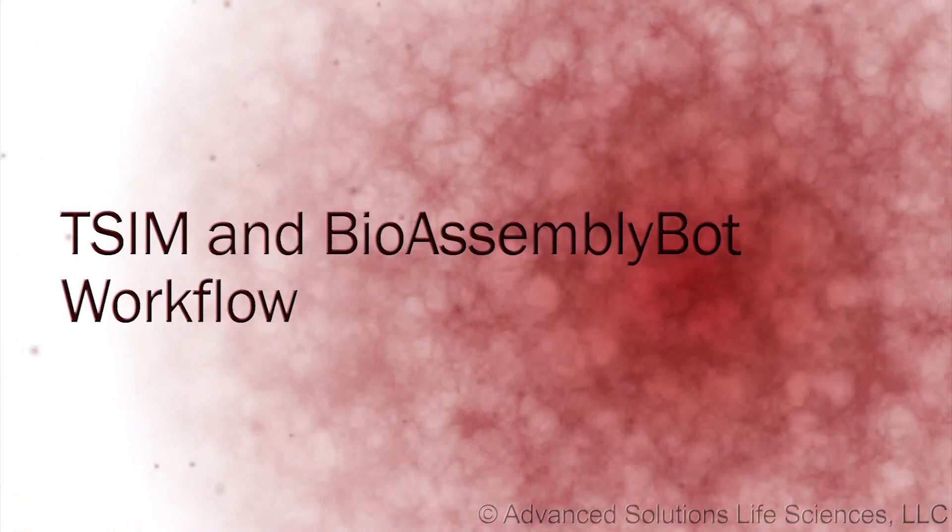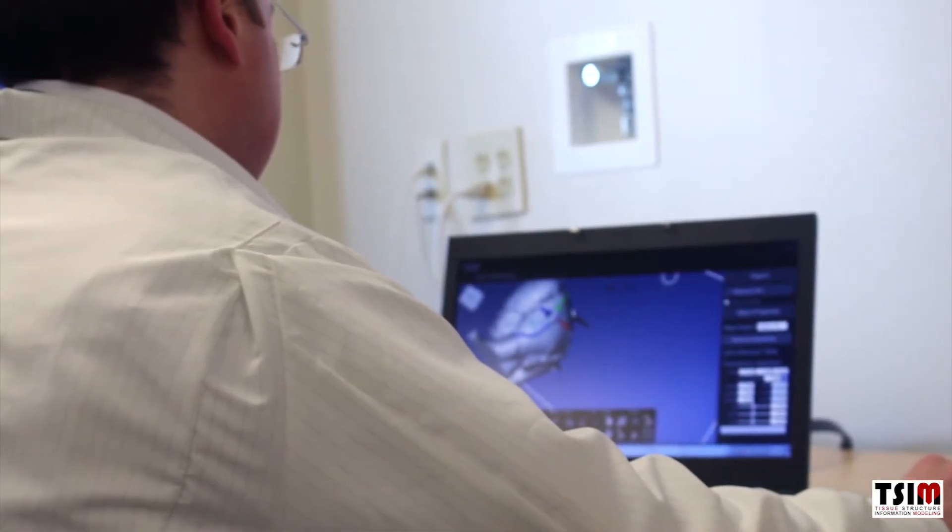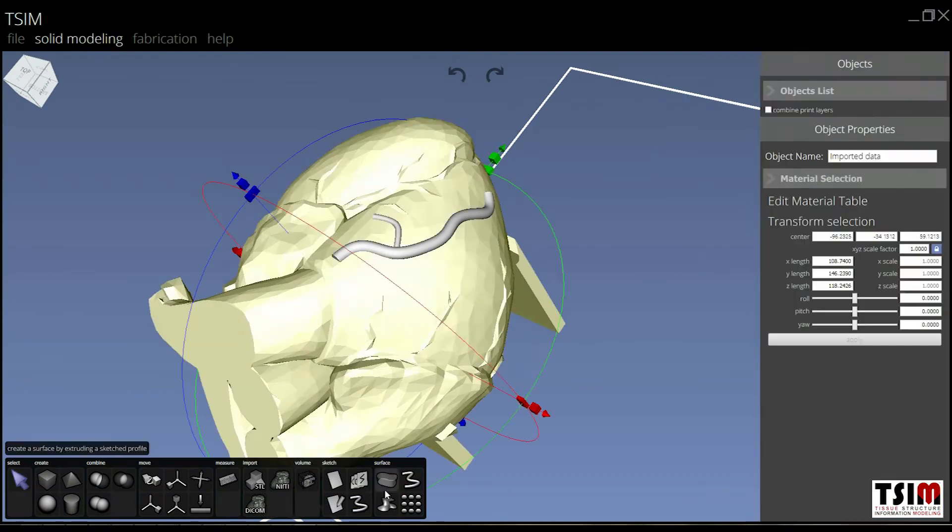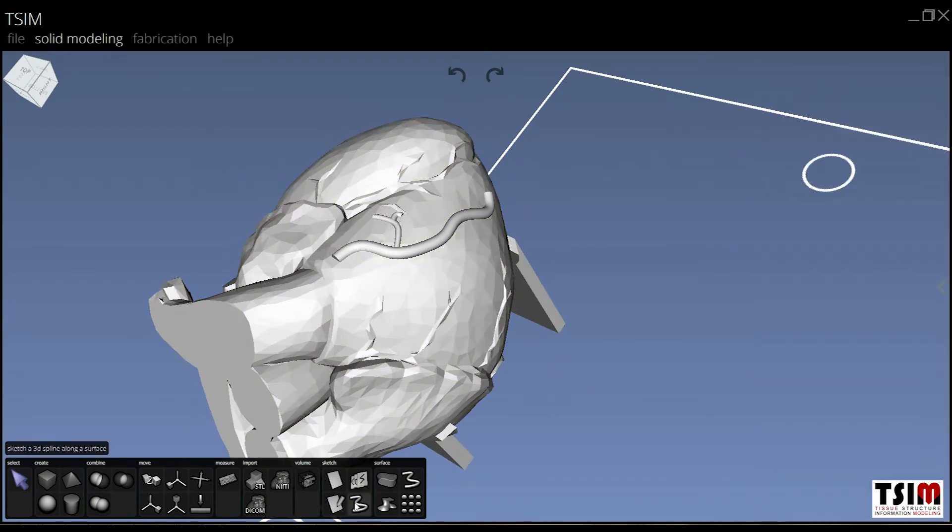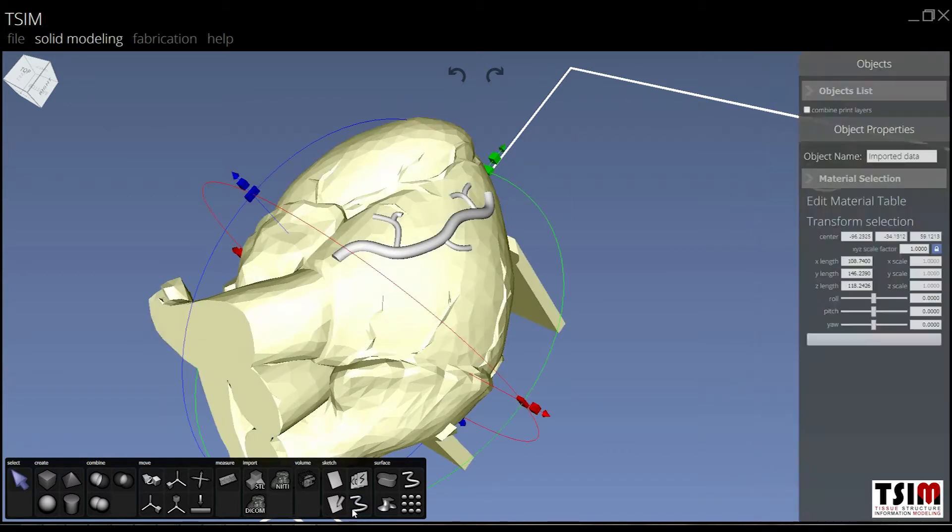In this particular example, we'll explore the tissue prototyping capabilities of the TSIM and BioAssemblyBot system. Here, working from a pre-existing heart model, we're going to add a new coronary vascular tree design to the surface of the heart in an effort to explore different ways to construct heart tissue.